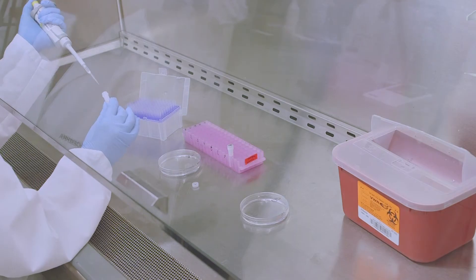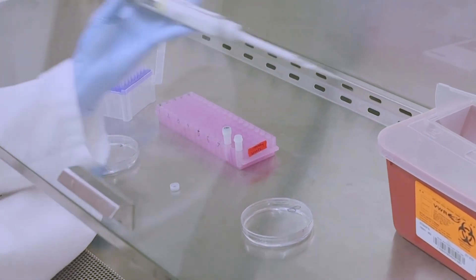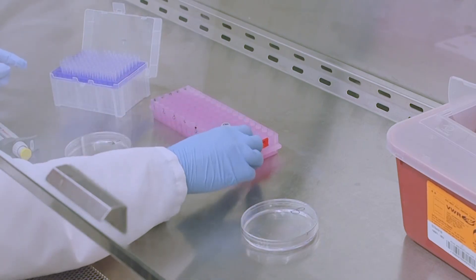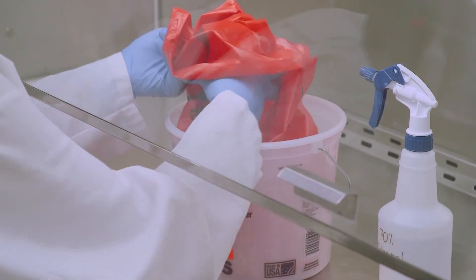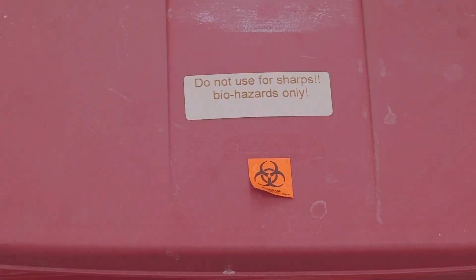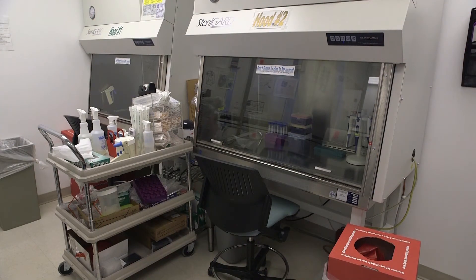When transferring liquids or pipette mixing, always use slow and careful motions to prevent splashes and aerosols. Handle one sample at a time. Keep petri dishes, plates, flasks, bottles, tubes, and pipette tip boxes closed or capped when not in use. Transfer infectious materials and waste as far back into the cabinet as possible. Discard all contaminated materials in a bag inside the designated waste area of the biosafety cabinet. Close the bag and replace it when two-thirds of the bag is full or at the end of your work. Do not use a Bunsen burner or an open flame inside of the biosafety cabinet.